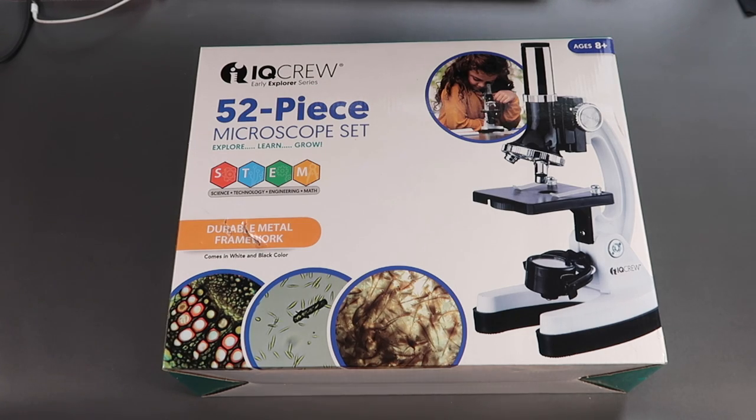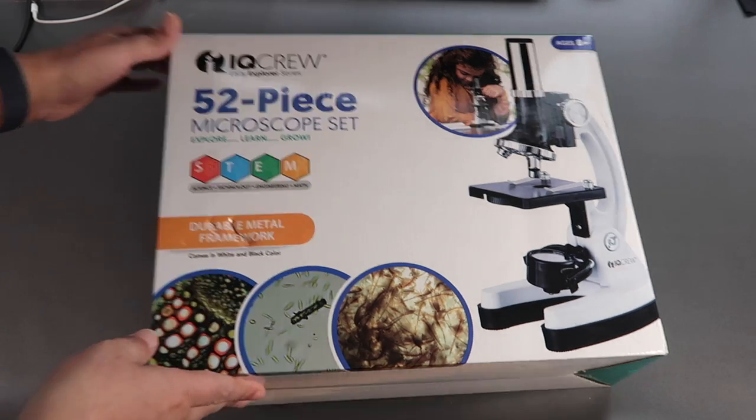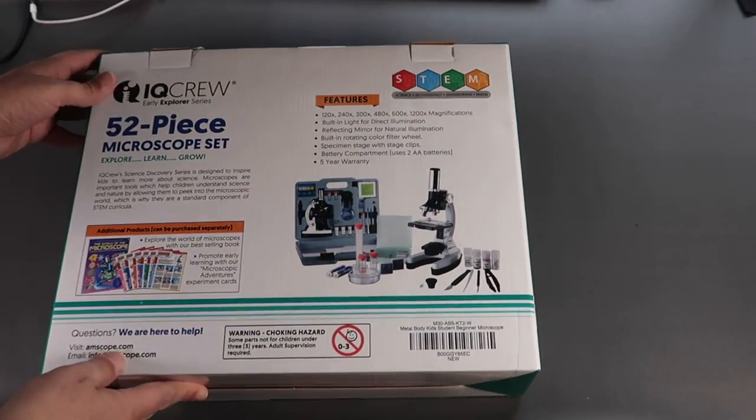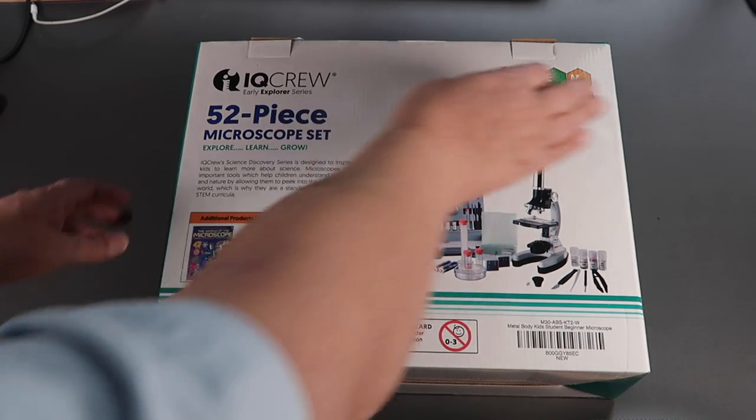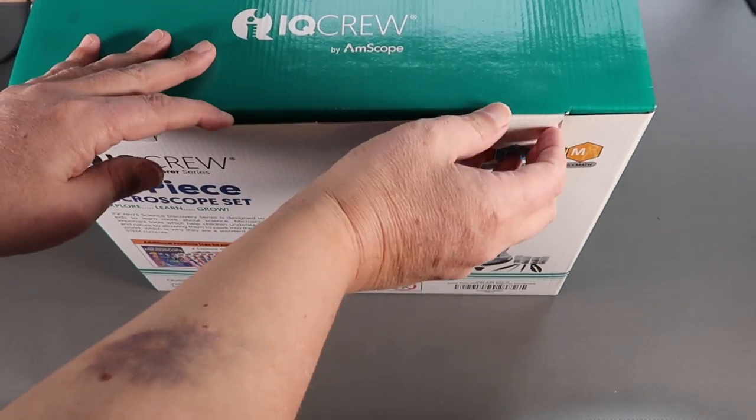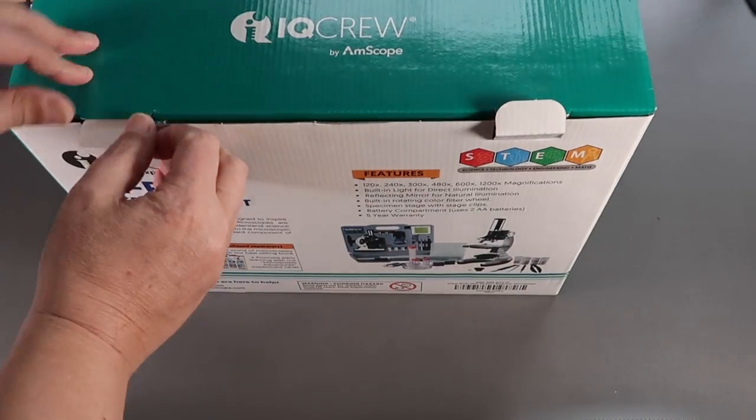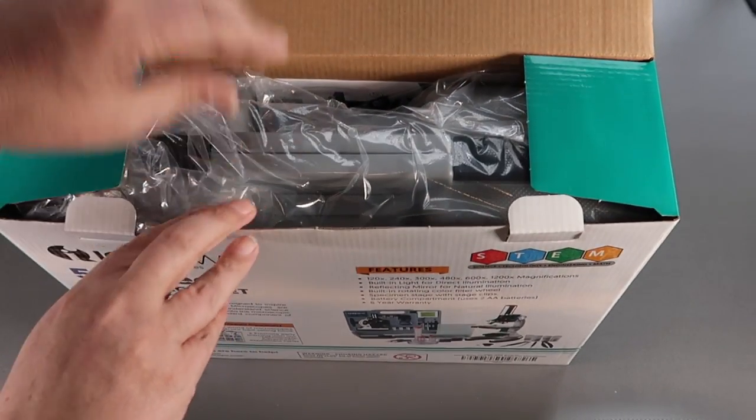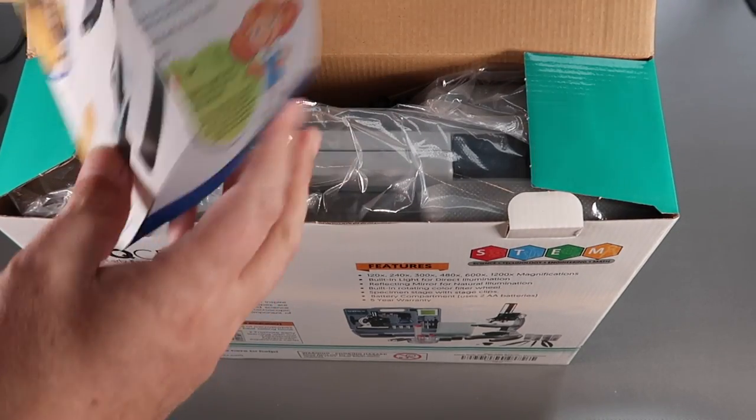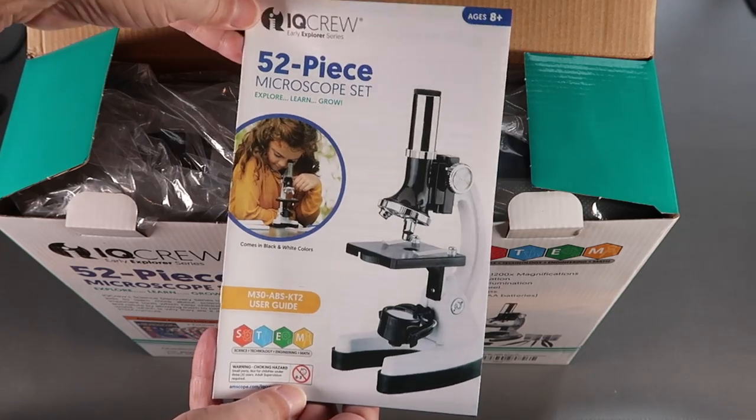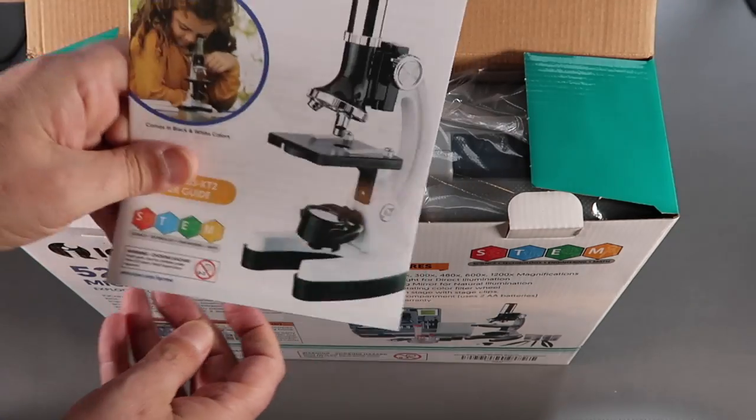In this video we're looking at this 52-piece microscope set. It's from IQ Crew and it's designed for ages 8+. Let's take a look at what's inside. There's an instruction book, which we'll come back to later.